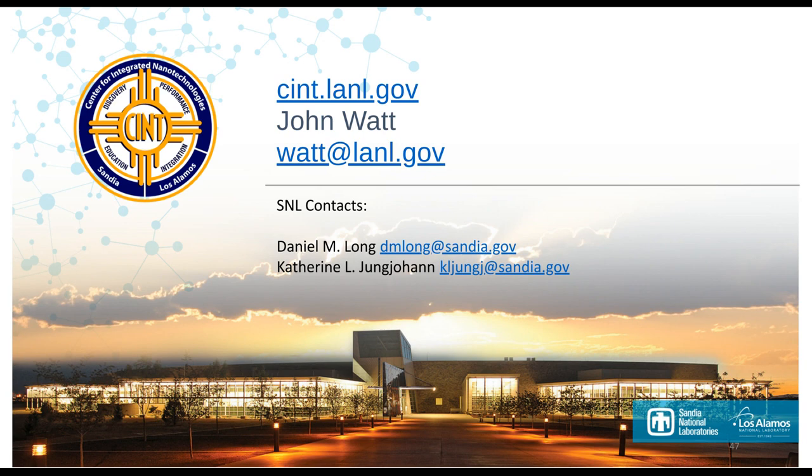All right, thank you, Daniel. Next question is for John. How do you transfer the air-sensitive sample to the TEM? Yeah, that's a good question too. That's a very critical step.